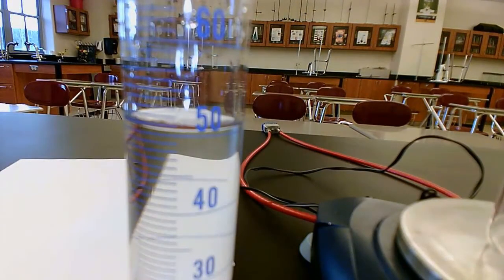All right. So now, that is all for part A for right now. We have the mass of the beaker. We have the mass of the water. You can put an X through mass of beaker plus water. You have your volume of your water. And now we're going to calculate the density later, but we're going to move on to part B.